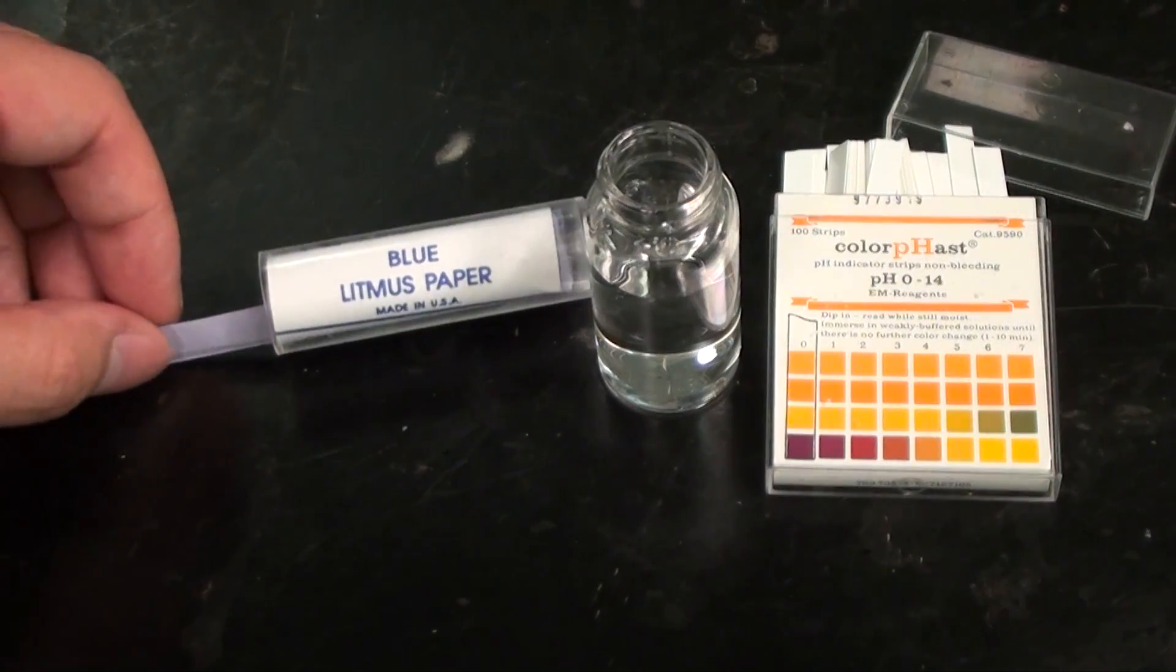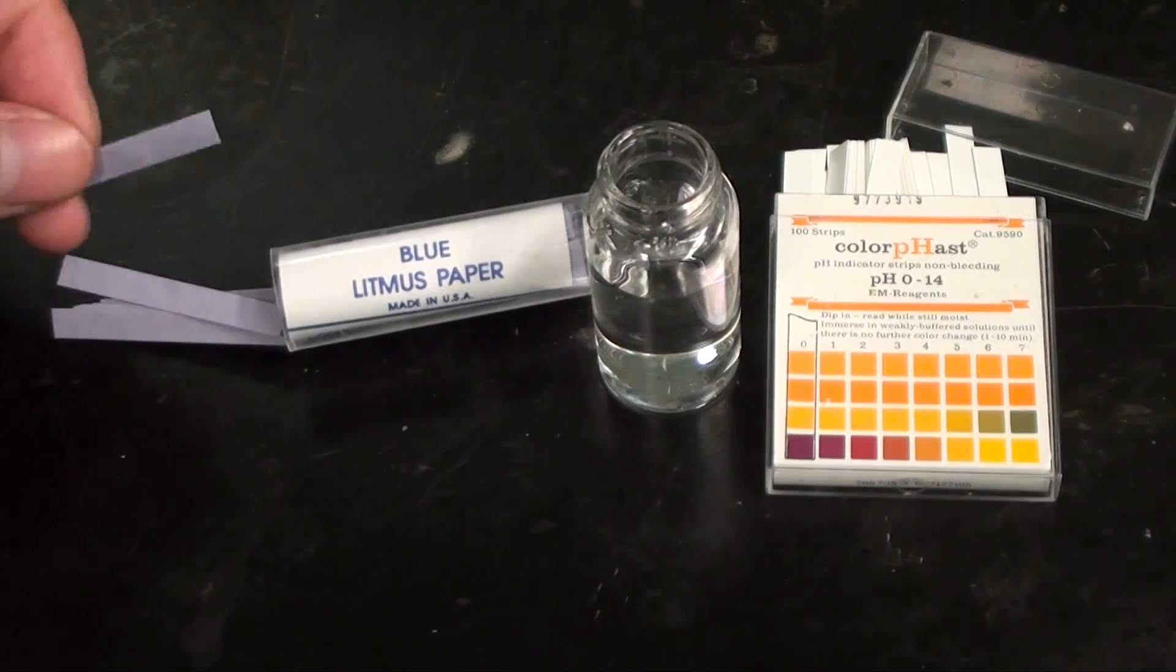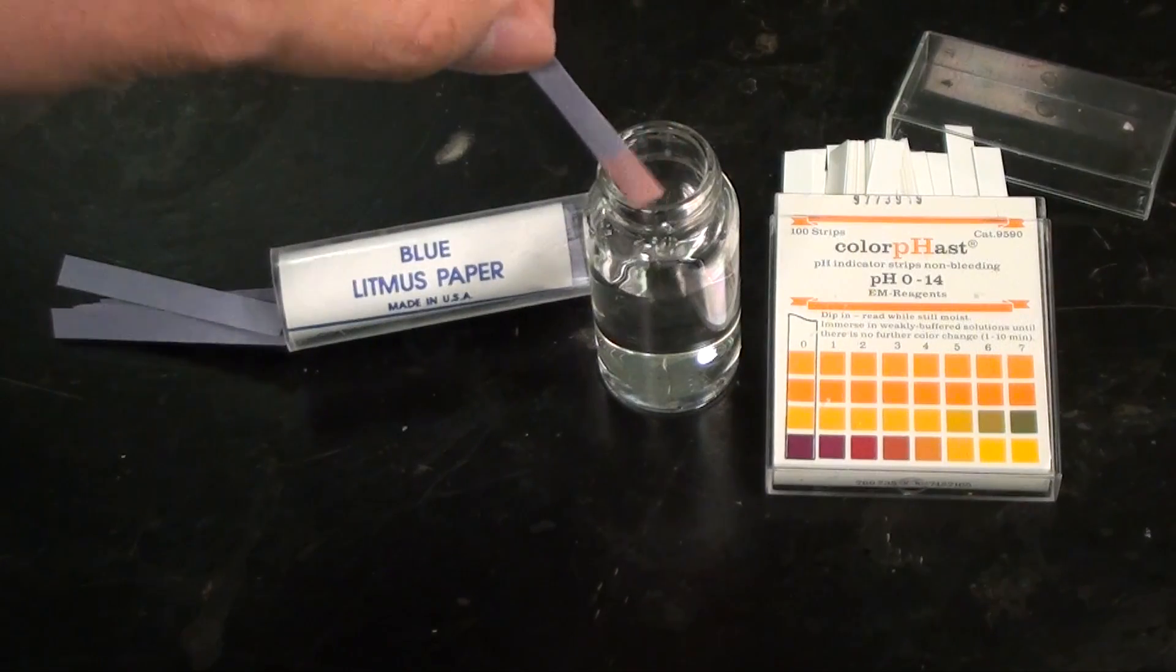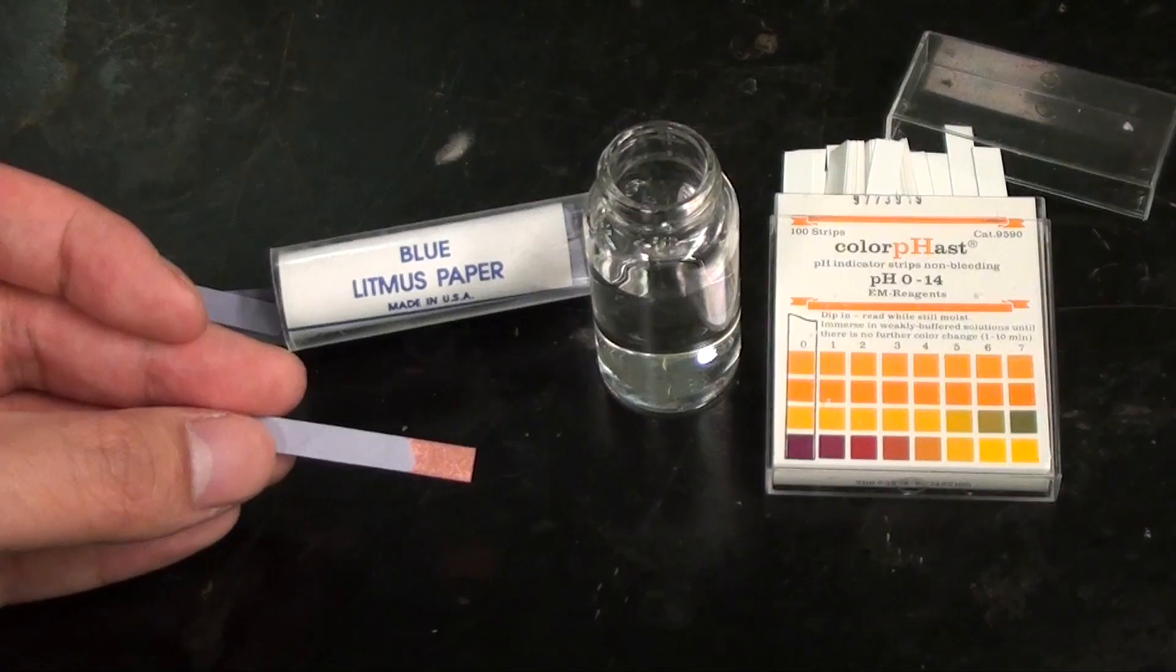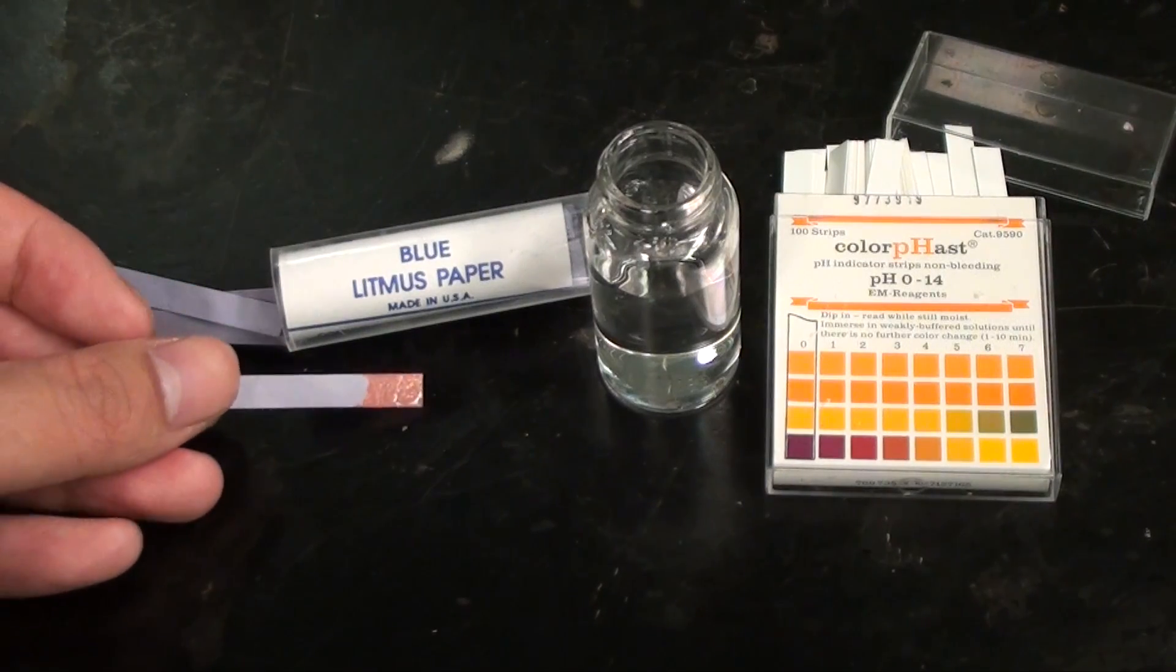On the left here I got blue litmus paper which if dipped into an acidic solution will turn pink or red. Now I don't have it here, but there is also a red litmus paper that turns blue if dipped into basic solutions.